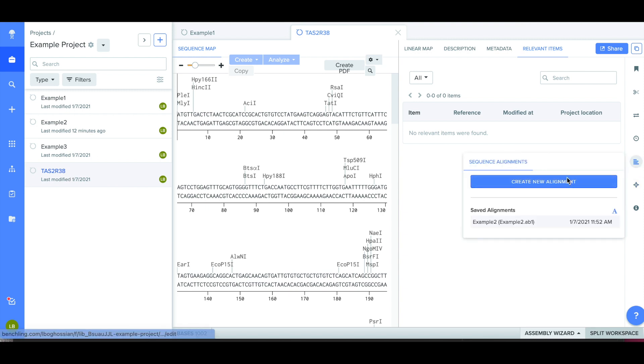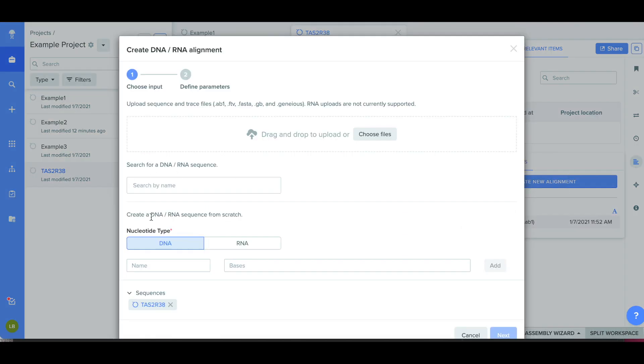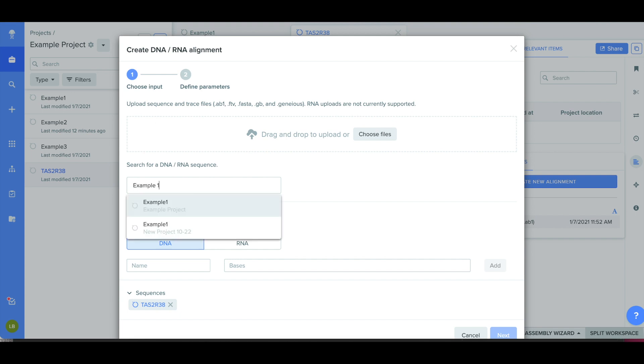This window will then pop up and it will ask you which sequences you want to compare the reference sequence to.